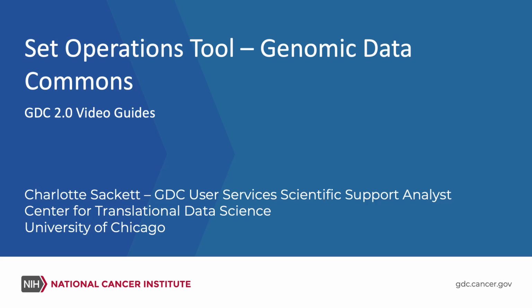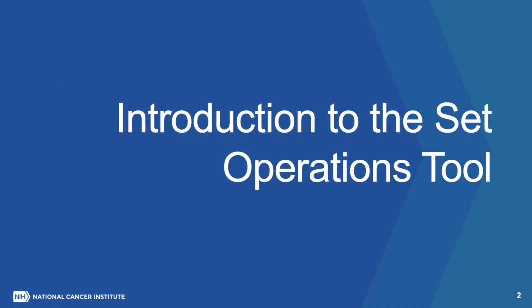Set Operations Tool. Genomic Data Commons, GDC 2.0 Video Guides. Charlotte Sackett, GDC User Services Scientific Support Analyst, Center for Translational Data Science, University of Chicago. Introduction to the Set Operations Tool.